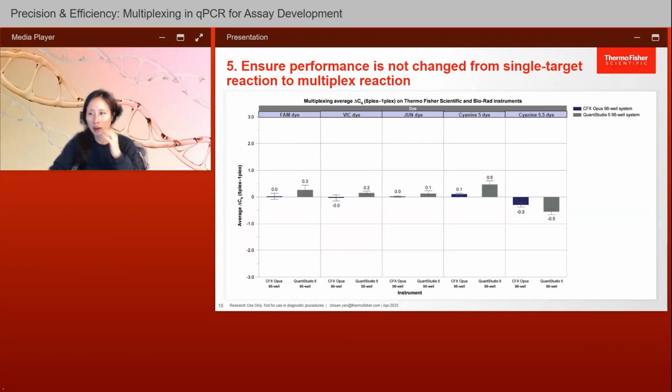performance. And just for curiosity, we wanted to see, okay, the same assay, we have 2 instruments, does it run okay in a different instrument as well? And as you can see, that seems to be the case for both instruments tested here. We have CQ values that remain similar with scale up to multiplex. So they're all within 0.5 or less difference, which is awesome.